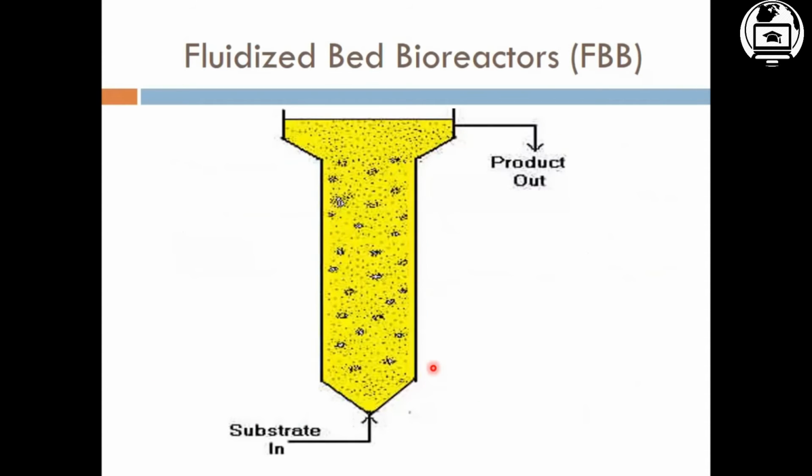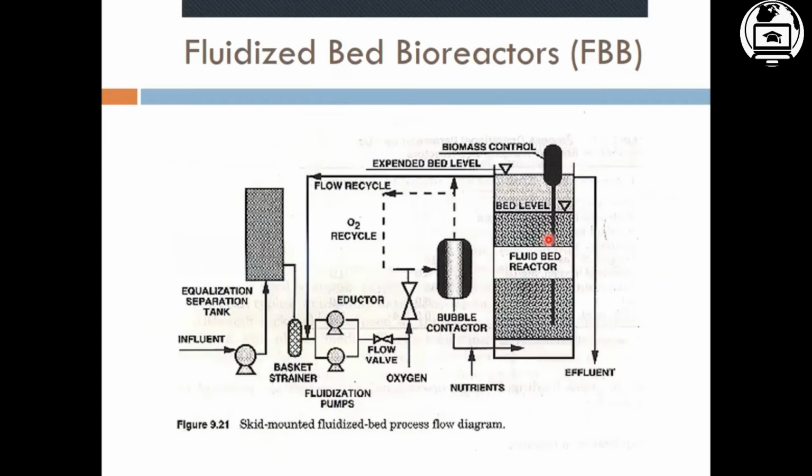This is just a generalized picture of a fluidized bed reactor, in which there is a substrate coming in from the bottom. There is a fluid in the form of liquid, or it may be in the form of gas, and your product is skimmed out from the top of the bioreactor.